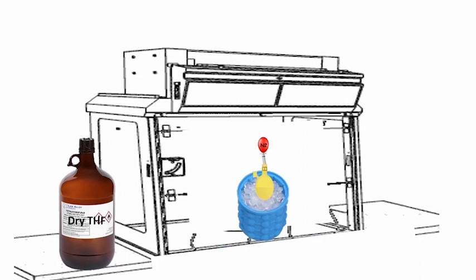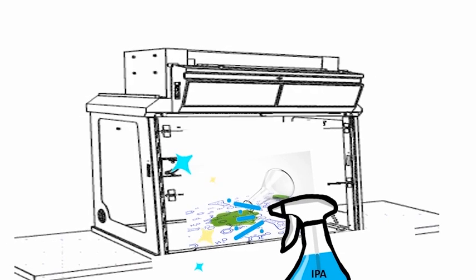If somehow spillage of lithium aluminum hydride happens when putting the reaction, immediately quench it with isopropyl alcohol, IPA. You should keep the IPA nearby so that if any spillage happens, you can immediately take action and quench it.